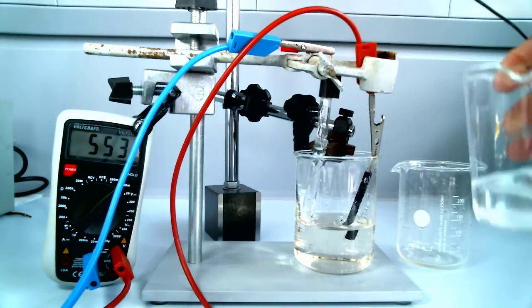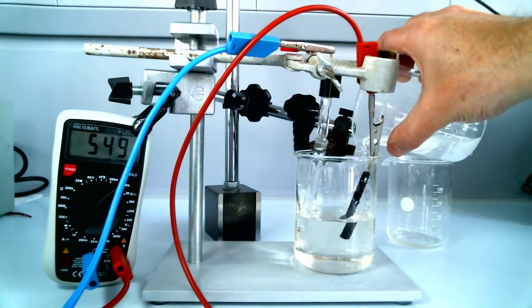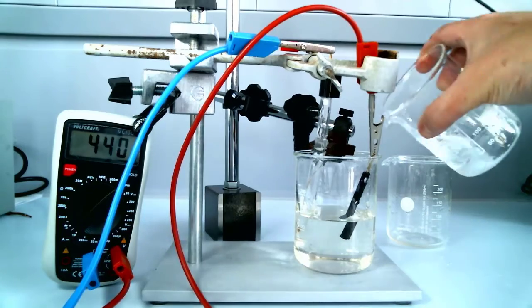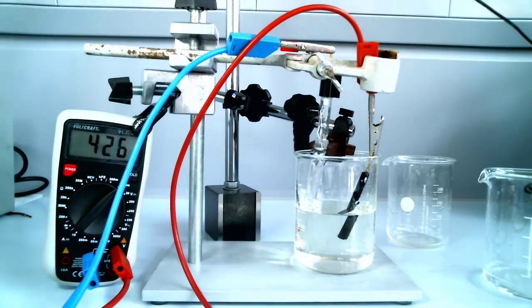Now I'm going to add some iron 2 to the solution, which will change the redox potential of the solution, because we've got a couple, iron 3, iron 2. That will reduce it down to 400 and something. I think it's about 413 when it finally settles down. Obviously it's got to mix around and it's got to equilibrate.